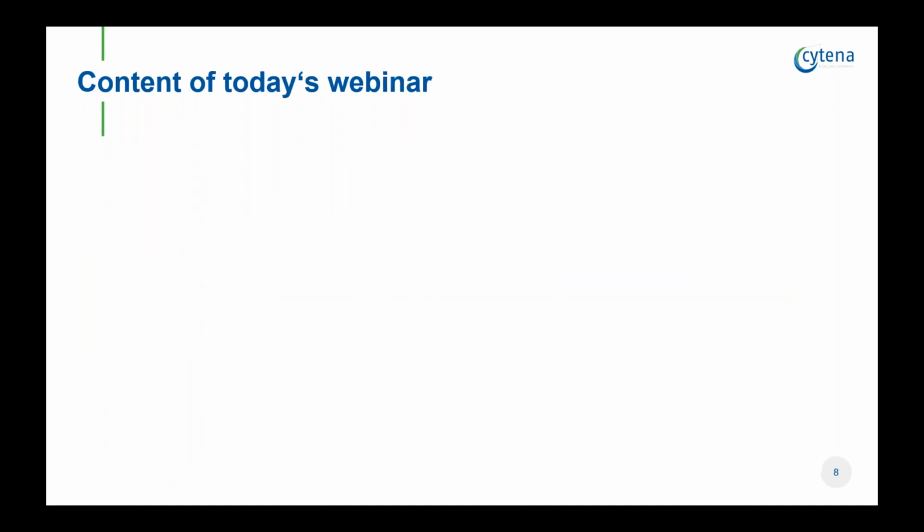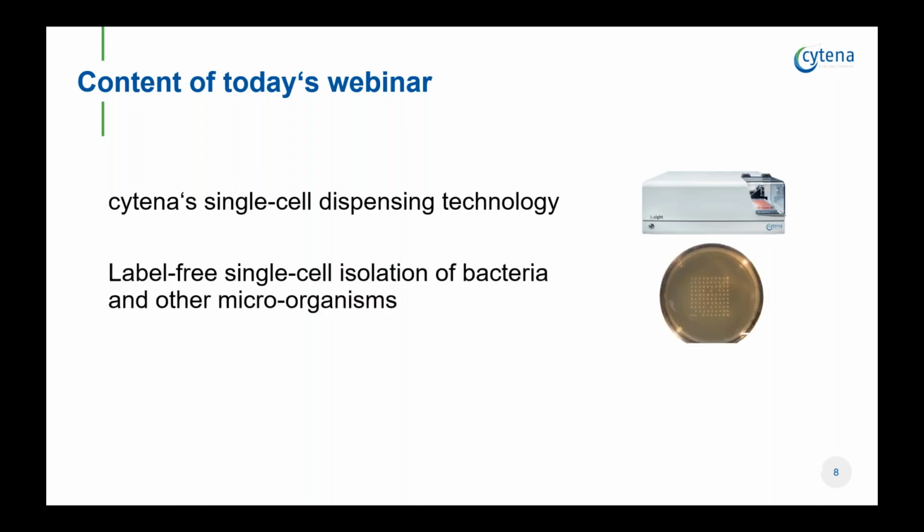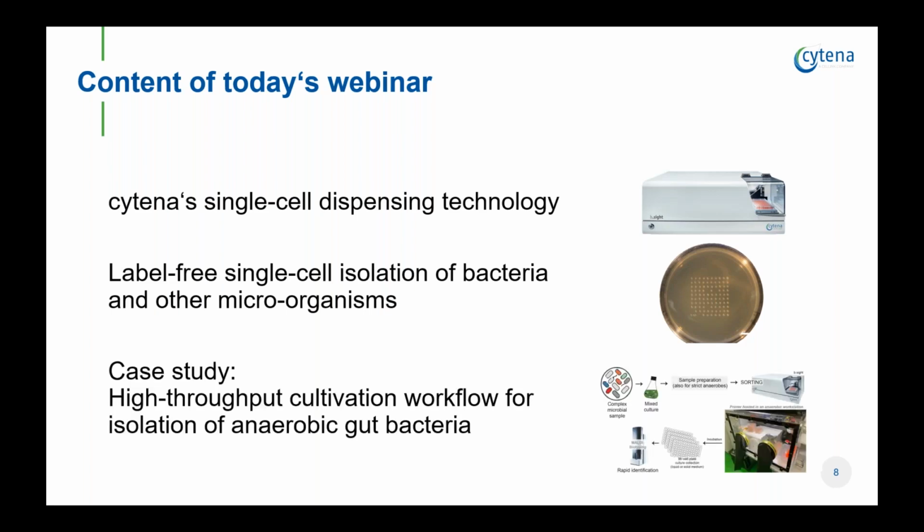So what can you expect from today's webinar? Let me briefly go through the agenda. First, I will spend a few minutes to explain how our single-cell dispensing technology works for those of you who haven't got in touch with it. Then I will show you how one can use the technology to isolate microorganisms in a label-free manner. And finally, we will discuss a high-throughput workflow for the isolation and cultivation of bacteria from gut microbiota.